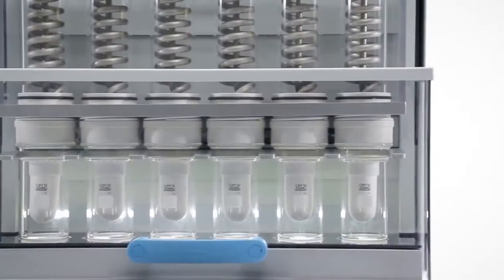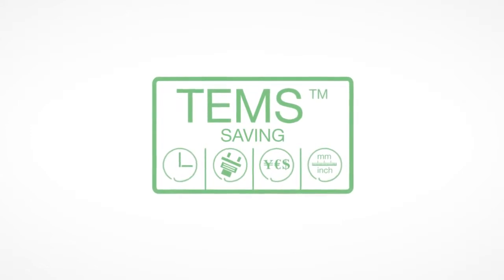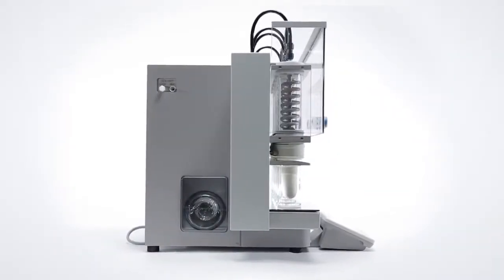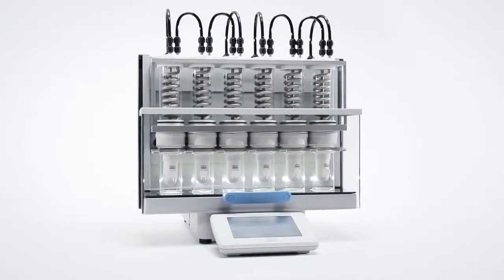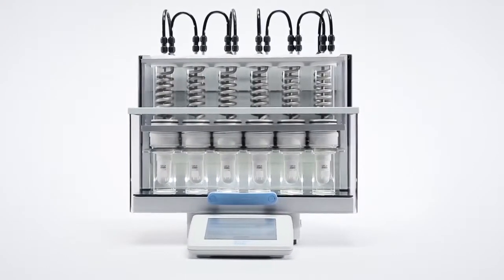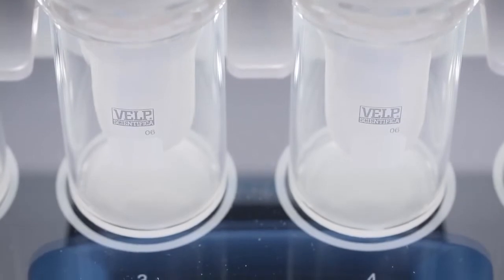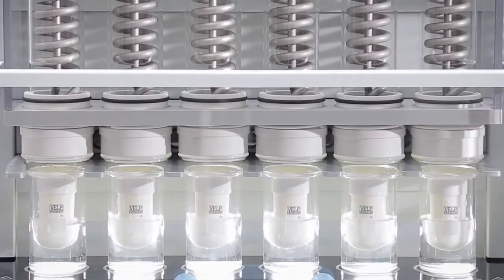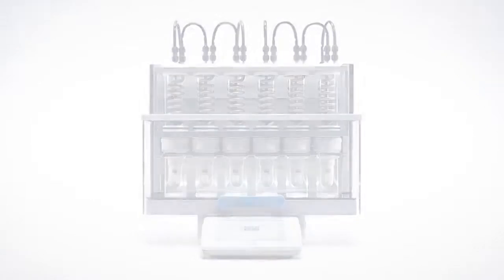The SER 158 incorporates the exclusive TEMS technology to minimise your overall operating costs. Compact design, low energy consumption and high solvent recovery makes the VELP SER 158 the perfect solution for a large variety of solvent extraction applications. The SER 158 is yet another reliable analytical instrument designed and manufactured in Italy by VELP Scientifica.